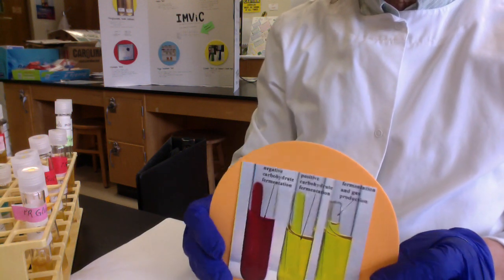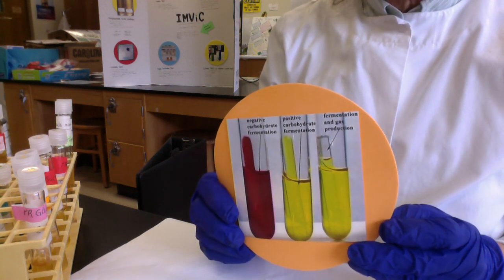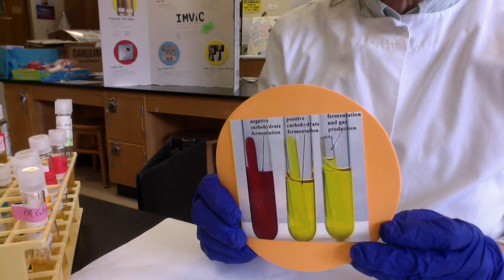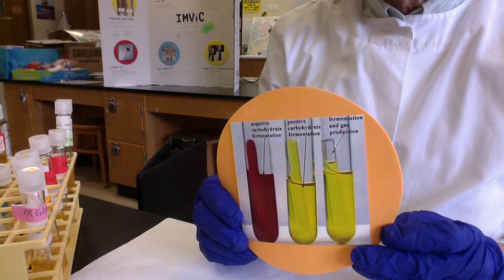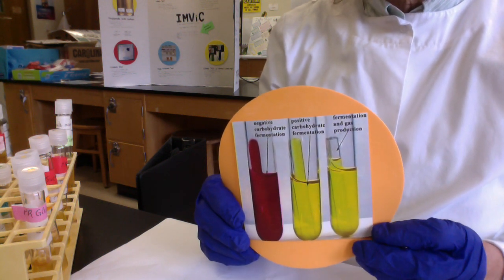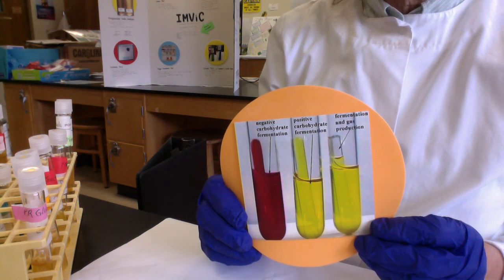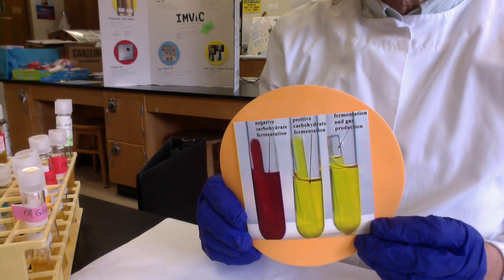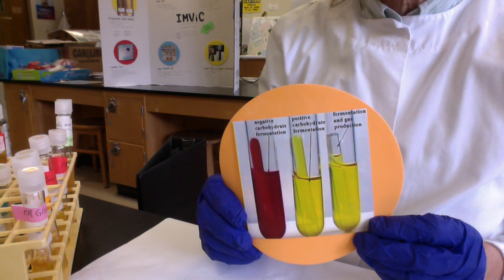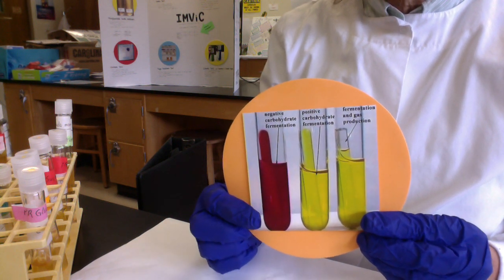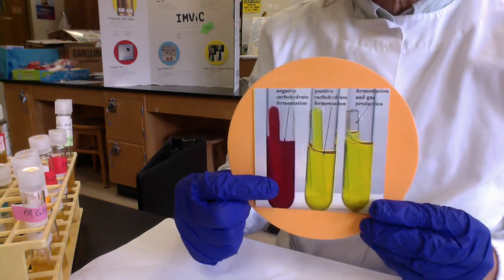The PR sugar fermentation medium has a single sugar, and we name the media after the sugar: PR glucose or dextrose, PR lactose, or PR sucrose. In addition to sugars, we have proteins and amino acids as alternate carbon and energy sources for microbes that can't ferment sugars. The pH indicator is phenol red. At acidic pH, phenol red turns yellow, and at alkaline pH, phenol red turns dark red fuchsia.